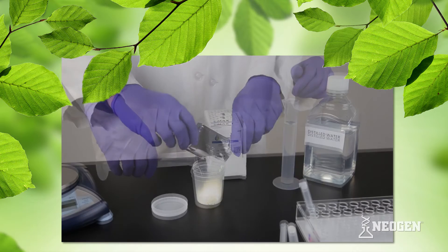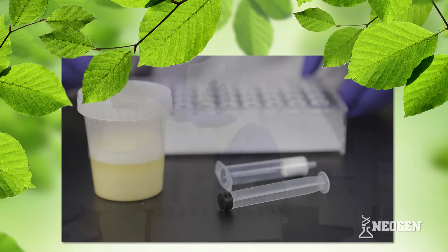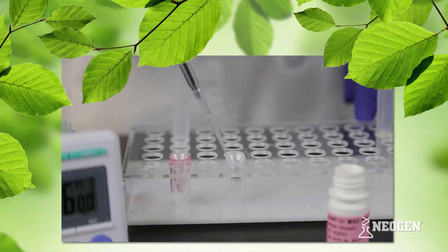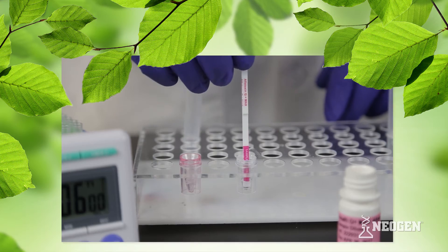Here's how simple your mycotoxin testing can be: add a packet of Neogen's extraction solvent to your ground sample and pour in distilled or deionized water. Shake, let it settle, filter, and then add to a sample diluent. Place a Reveal Q Plus Max test strip into the cup.